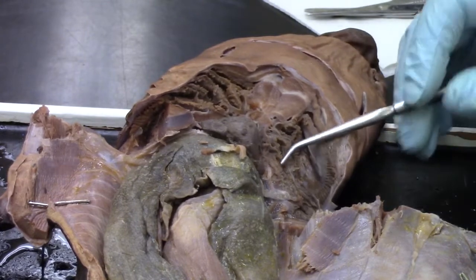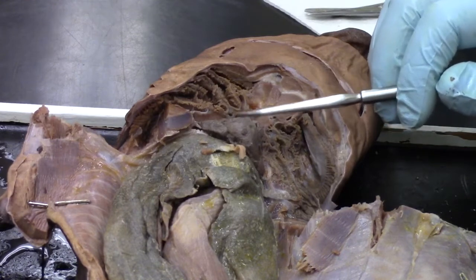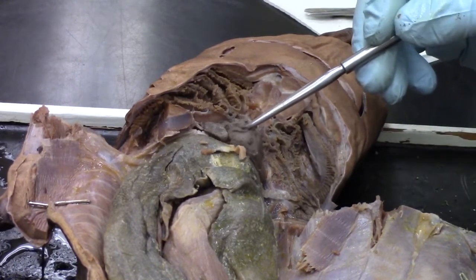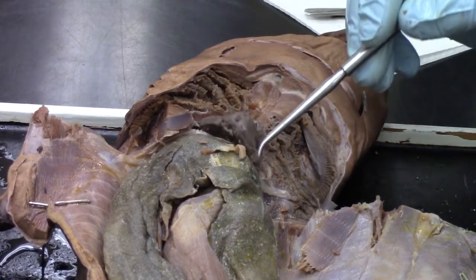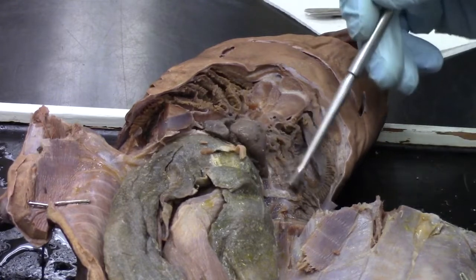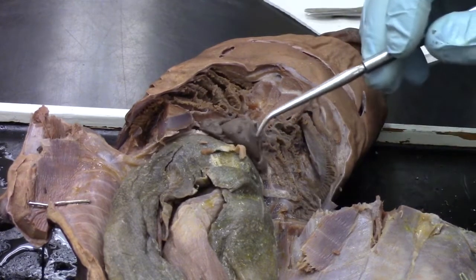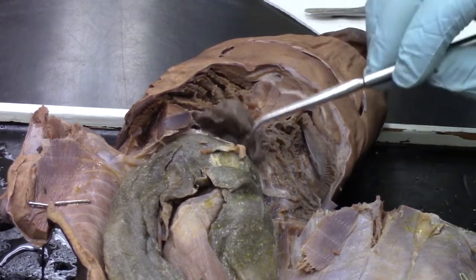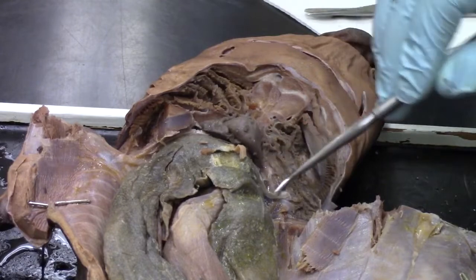Now, in addition to being able to see the gill filaments, we can also see the shark's heart. Right now there's a little bit of excess tissue that's just kind of a byproduct from the preservation. So I'm just going to move that out of our way, and then we'll walk through the actual anatomy of the heart.